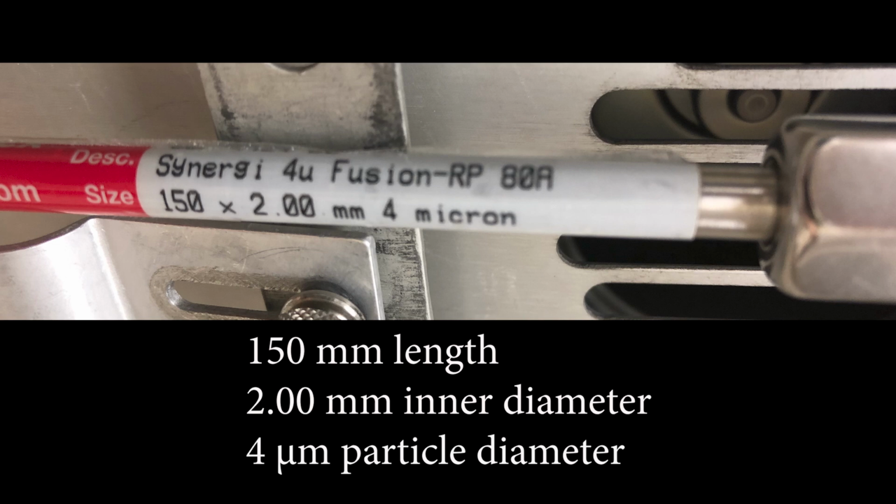This is the one that's on our instrument right now. They're going to give you some indication of the chemistry, like that Fusion RP, that stands for reversed phase. That means nonpolar. This is 150 millimeters long, 2 millimeter inner diameter, with 4 micrometer particles.